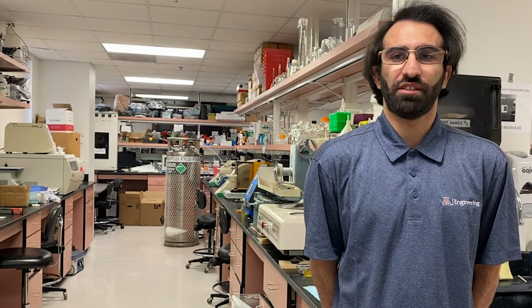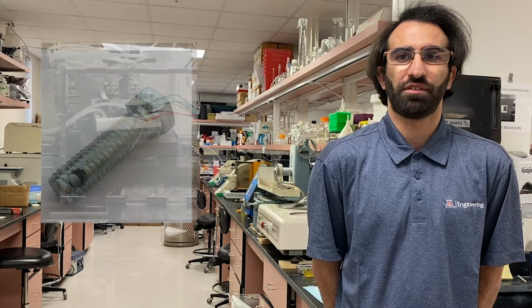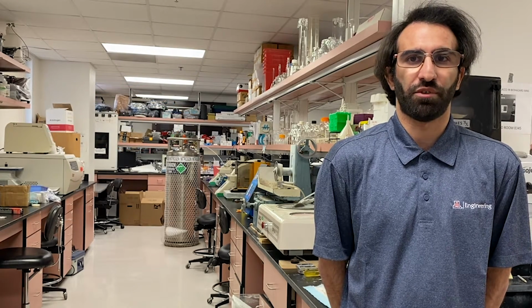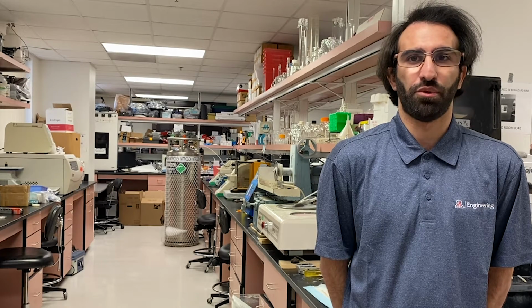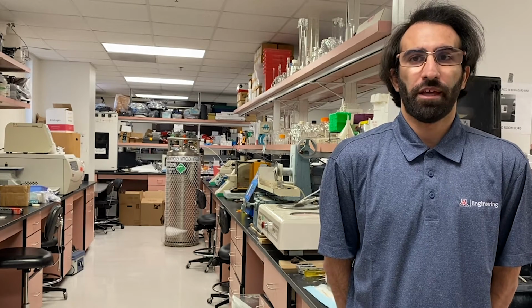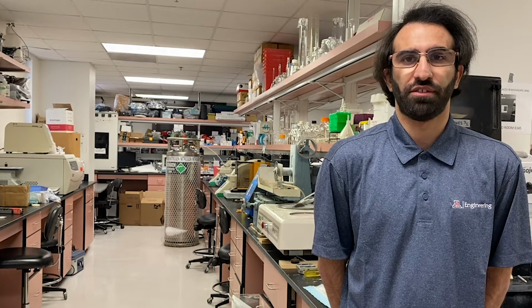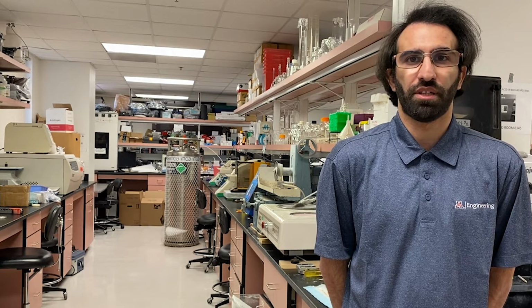Our new design concept incorporates medium injection into the bowl, supplying the loads to the scaffolds. Extraction is performed through a well plate cover that also houses the photoresistor used for pH monitoring. This design concept was selected in order to minimize the number of tubes and wires that are feeding directly into the tissue well. The existing bioreactor incorporates strain gauge with many wires entering each well, and the extraction tubing must enter each well directly in order to remove as much old medium as possible.